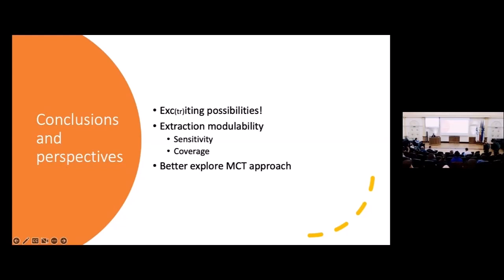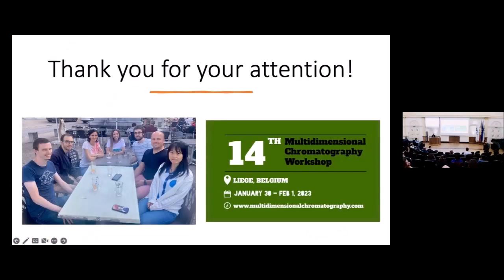We would also like to try with a smaller amount of sample by using, for instance, the total vaporization technique, and this would possibly allow us to reach an unsaturated headspace and have a better explanation of what phenomena are going on during the extraction. So I would like to thank again the organizers of this conference, and thank you for your attention.